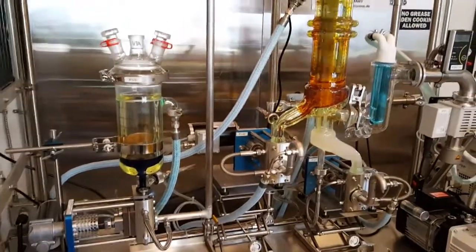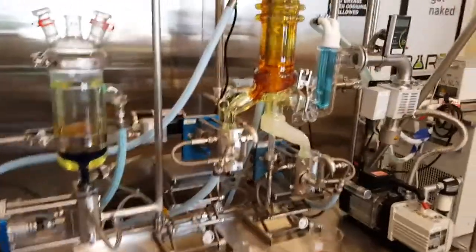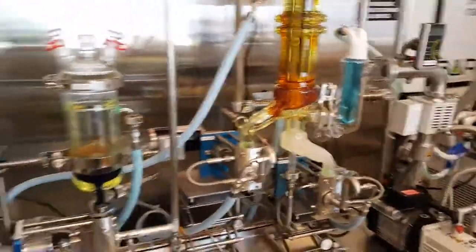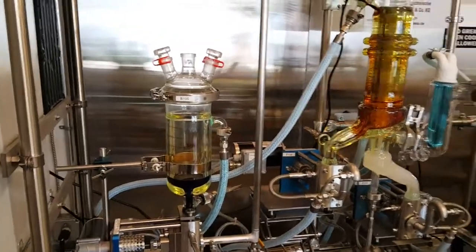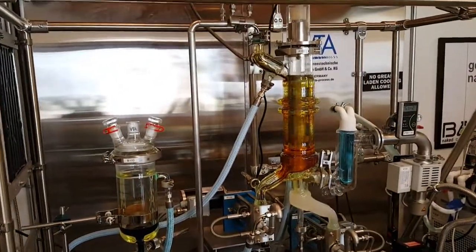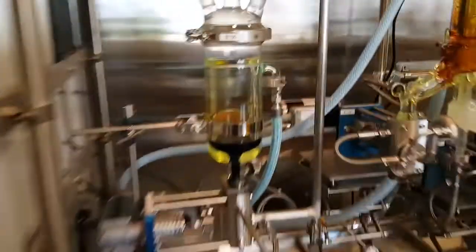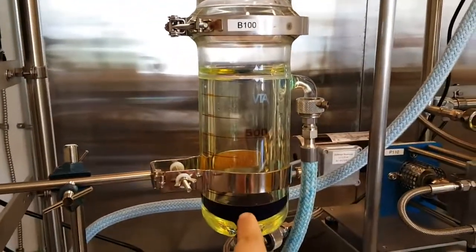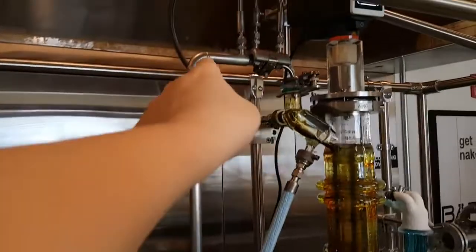We're at Suspended Brands. This is the Root Science short path distillation system. Here's where the winterized oil starts. This is jacketed, and there's a VTA pump that pumps it up here. The reason it's jacketed is to keep it molten and liquidy.